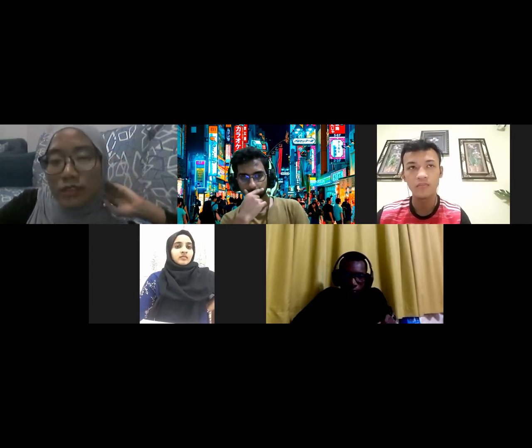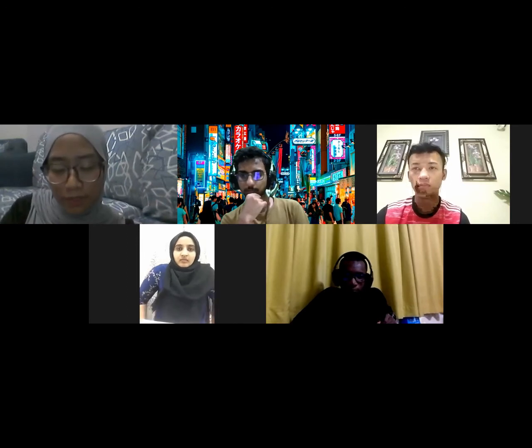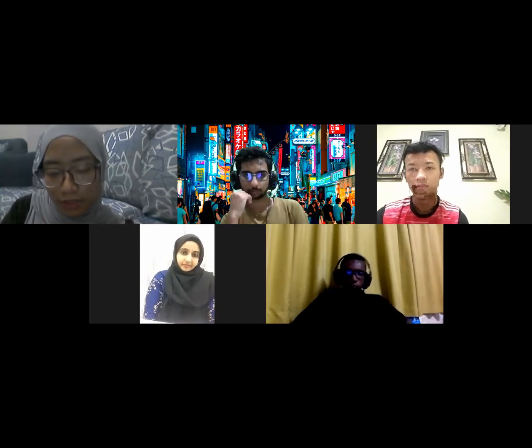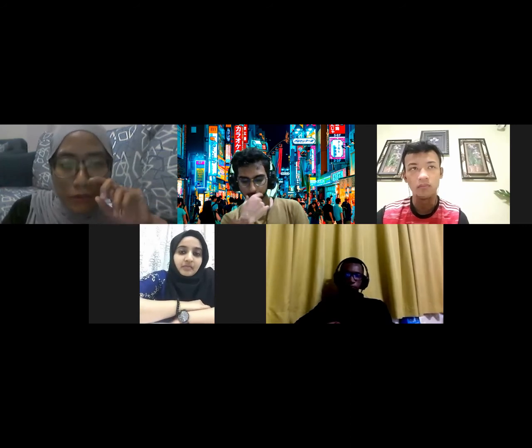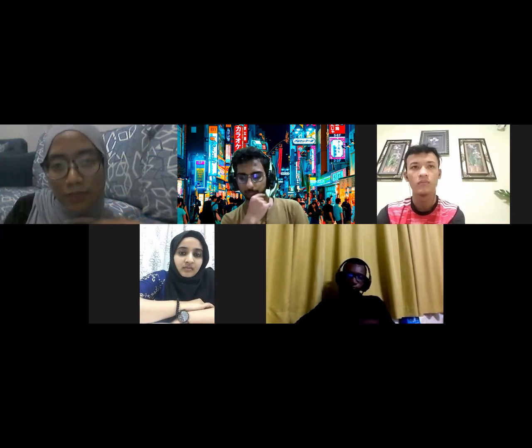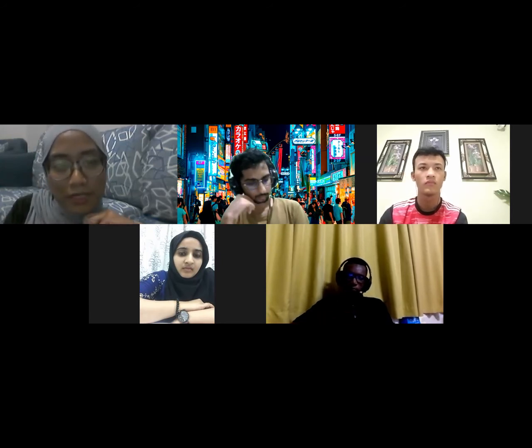Sorry. So for mine, let me open my data. Although the GC content is the same at 50% for my forward and reverse primer, the problem is at the self-complementary. My self-complementary values, one is 3 and the other one is 6. So 6 is a bit high, which is not good.